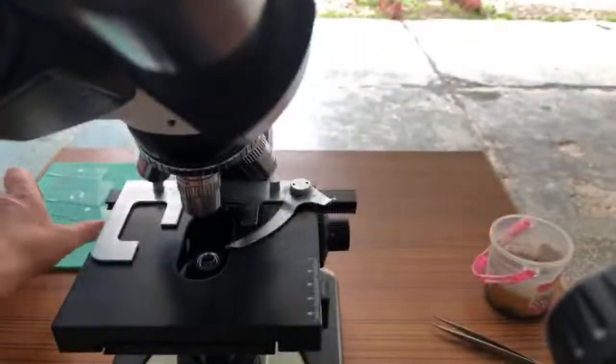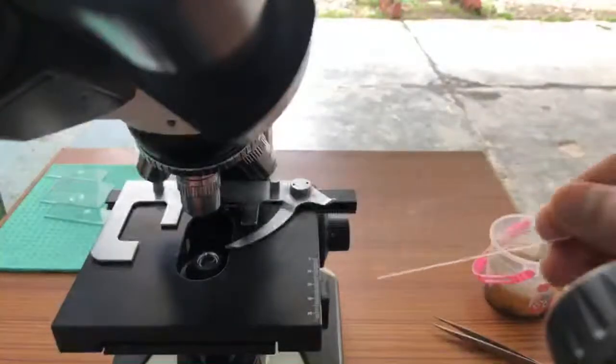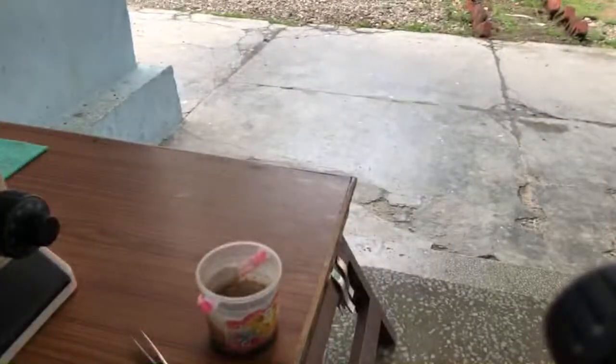What we are going to do is take a slide. On this slide, I'll be putting a small fraction of this. So let's just watch me as I do it.